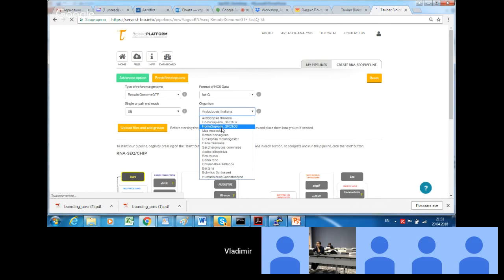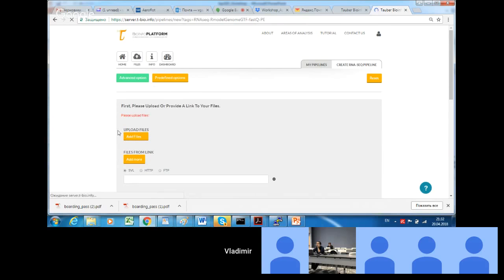For example, for Homo sapiens, we select Homo sapiens, and one of the genome assemblies. The format of input files, generally, if we start with raw data, is FASTQ, and the type of reads, single-end or paired-end reads. Then we proceed to uploading files.